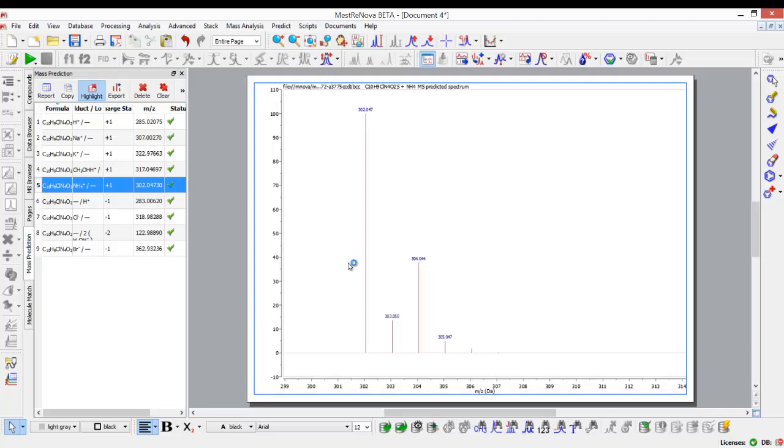This can be very helpful to chemists, especially when they are not very experienced with mass spec, but they do need to use it, for example, to confirm the identity of the compounds they are synthesizing.